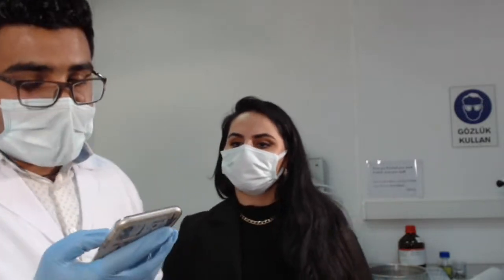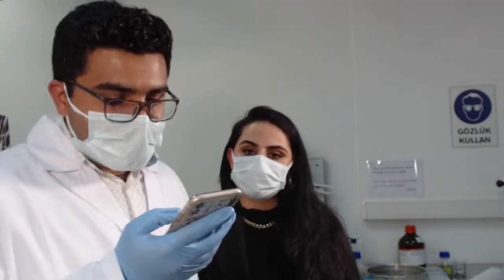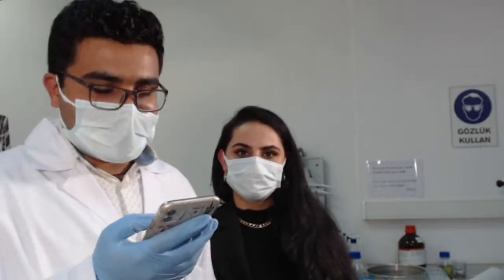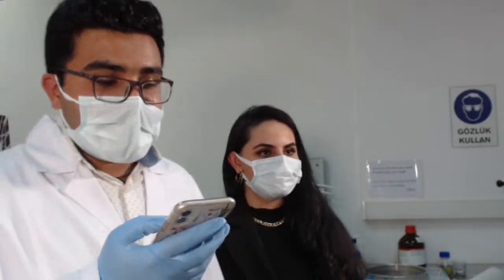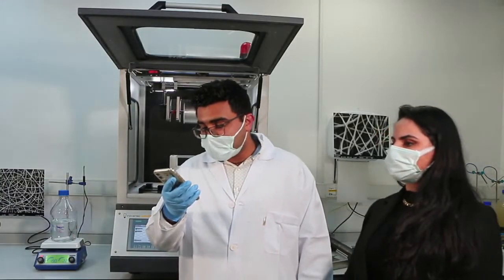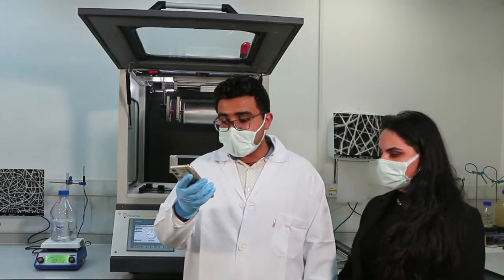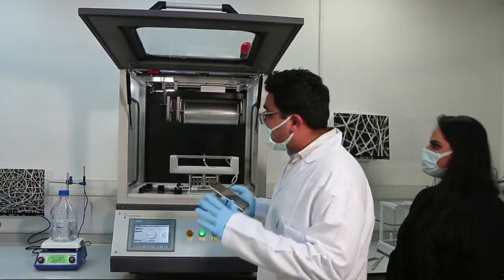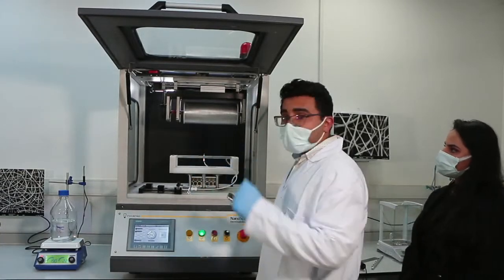Young Teo, I believe he's from the famous Electrospinning channel, thank you for joining our live stream today. He asks: what makes stray electrospun fibers get adhered to the machine wall? Very excellent question, Leon.